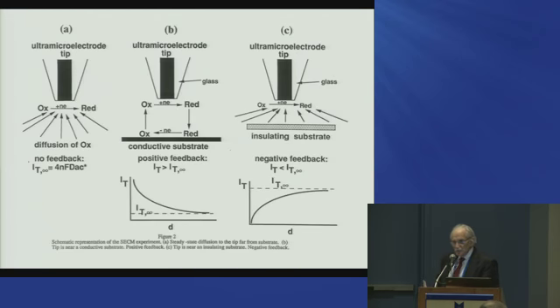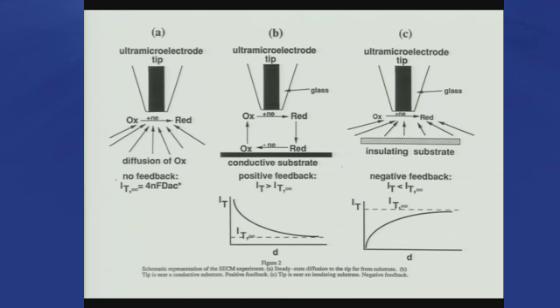What SECM does is it says, let's take that same ultramicro electrode, but let's move it closer to another electrode or to another surface and see what happens. And so let's take three cases. I have my ultramicro electrode here. I'm going to move it down to a substrate. This is the electrode where it's very far away, and so that's the equation we saw before. That's just a steady state current at an infinite distance.